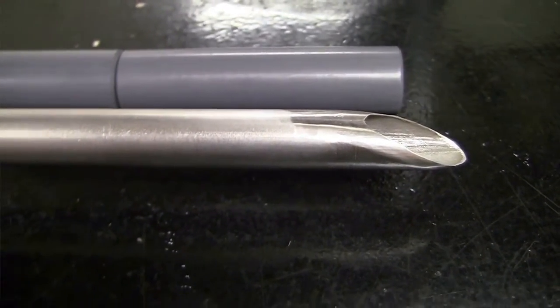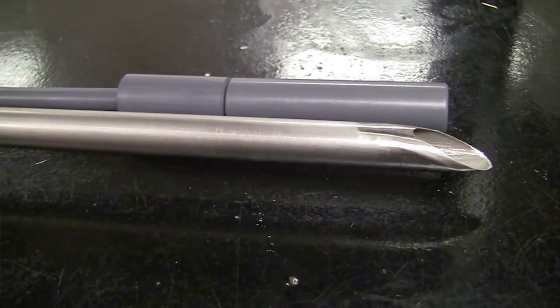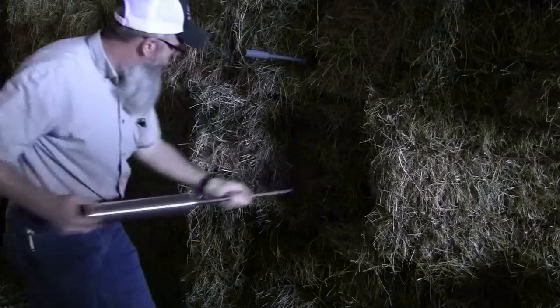And then finally, although there's many other options too, this is a Colorado hay probe. So this one's like a giant hypodermic needle, and the key here is to make sure that this point end is really nice and sharp. And so for this one, what we need to do is just jab it right into the bale.